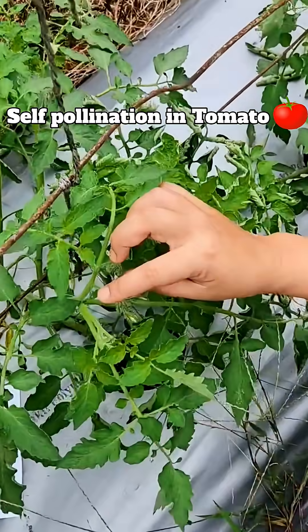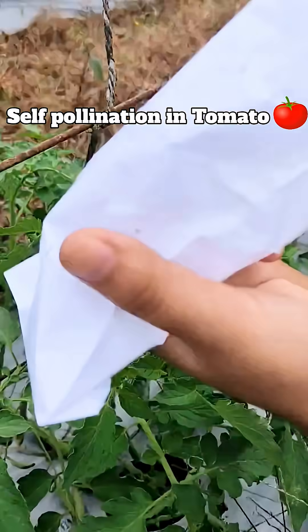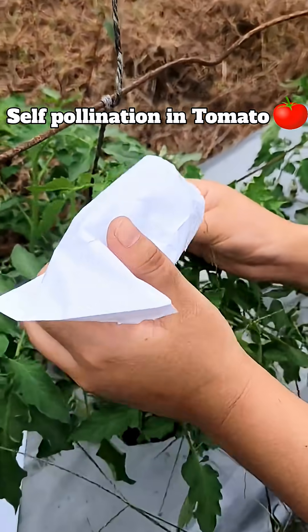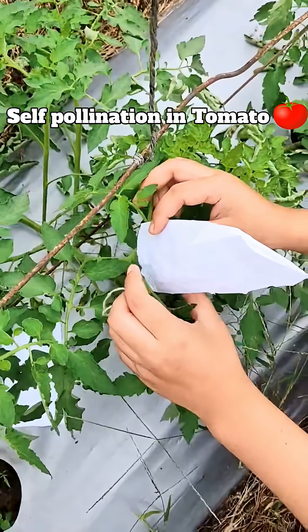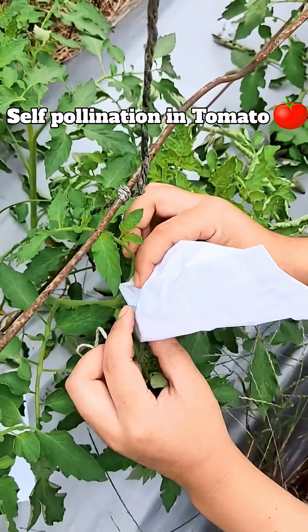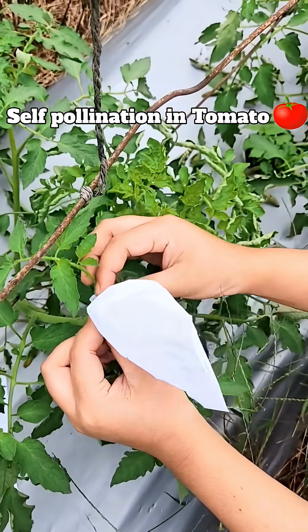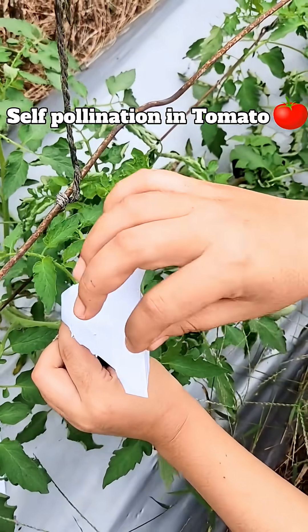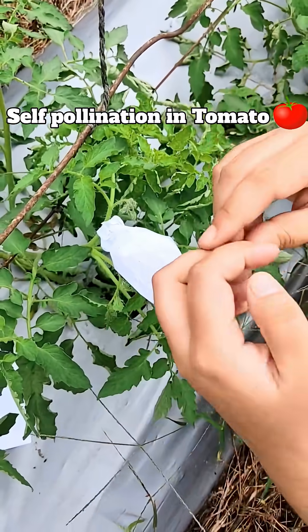In this video we are going to perform self-pollination in tomato. The first step is selection of buds — select unopened flower buds, like flowers that are going to open the next day or after a few days. Selecting this kind of bud ensures that pollen grains have not yet been released from the flower and the flower is not contaminated before opening.